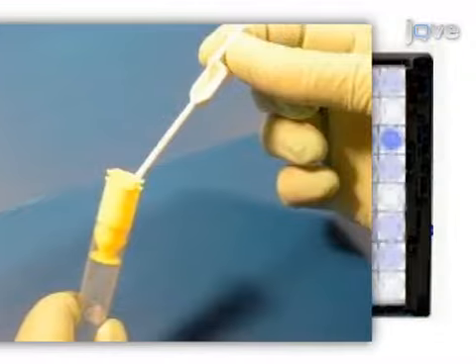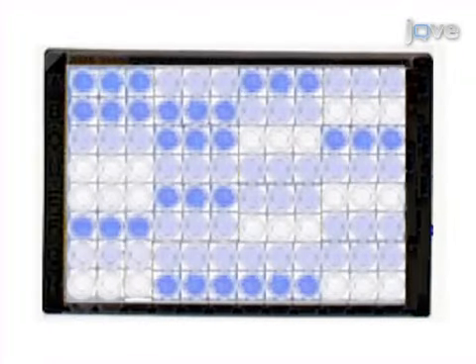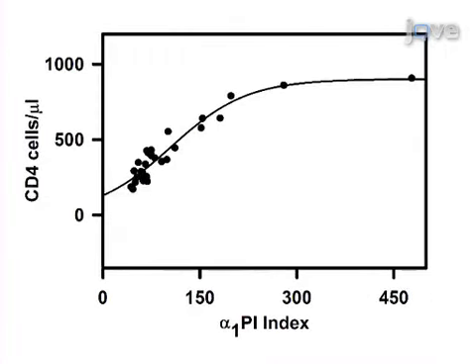Coomassie blue is added to the wells to stain total protein, and colorimetric measurements are taken using a microplate reader. Ultimately, the ratio of alpha-1-PI to total protein is determined and used to accurately assess CD4 counts based on an index value.